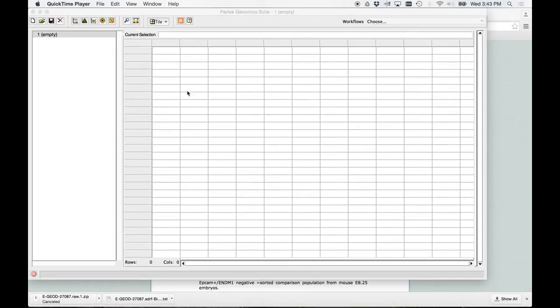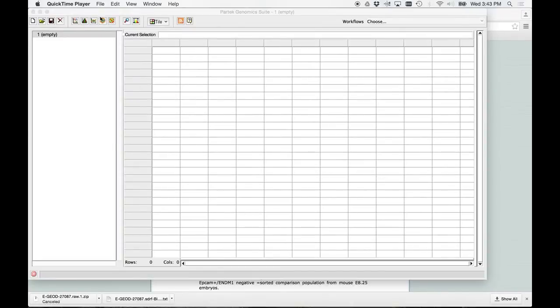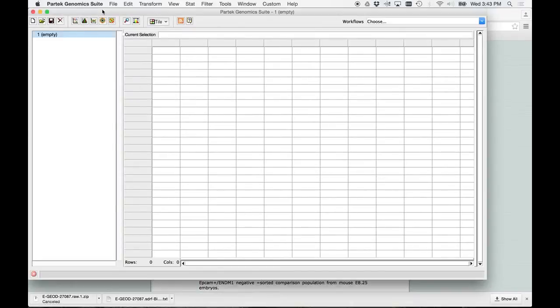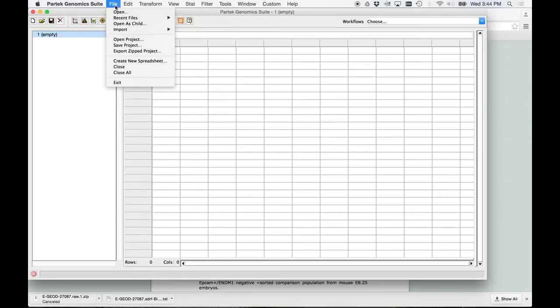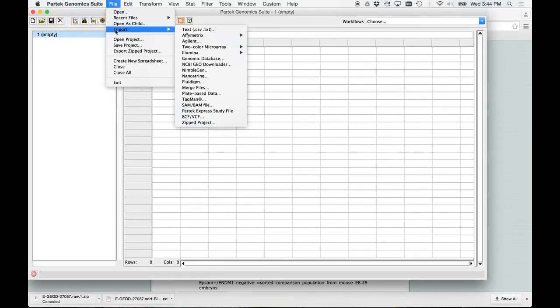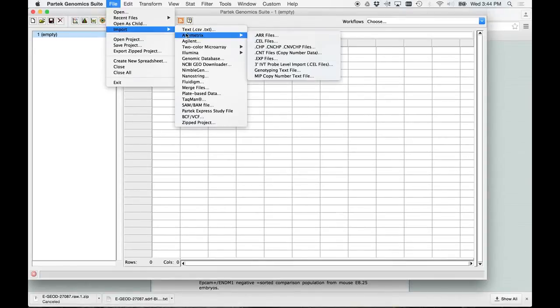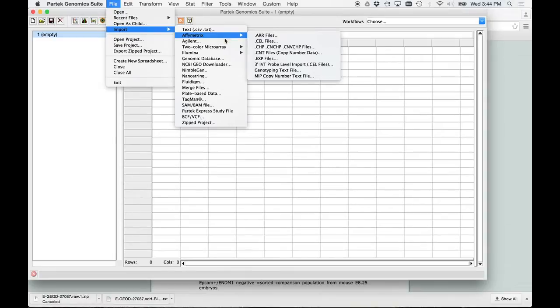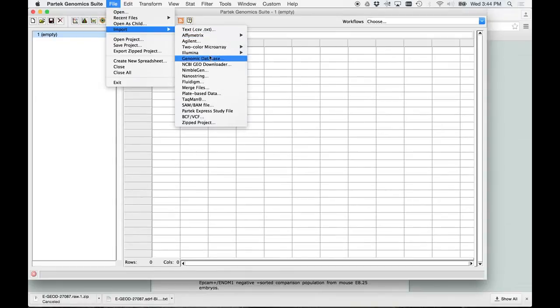This is the easy way to download genomic data from GEO. So go to PARTEC, and under File, you'll see Import. Now remember I told you this is Affymetrix data, and you can actually download the raw data, and I'll show you how to get to that. But here's what we're going to do, is we are going to download by the, do you see the NCBI GEO downloader? Got it? Click on that.